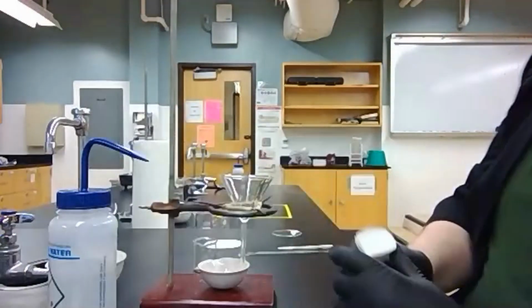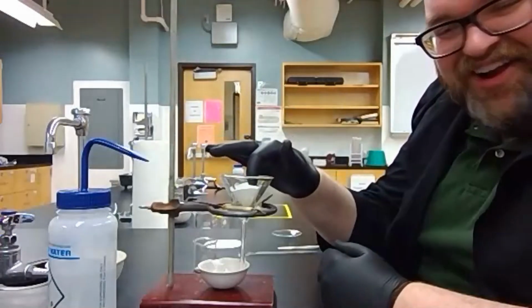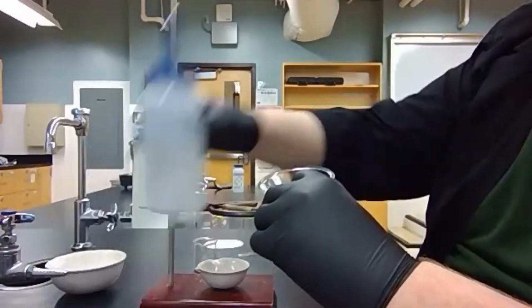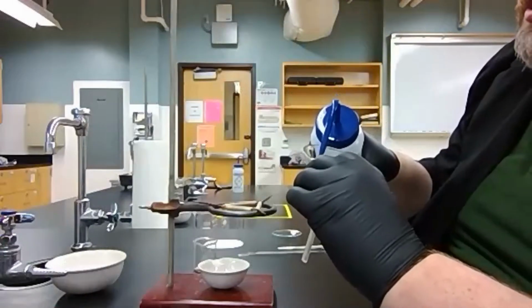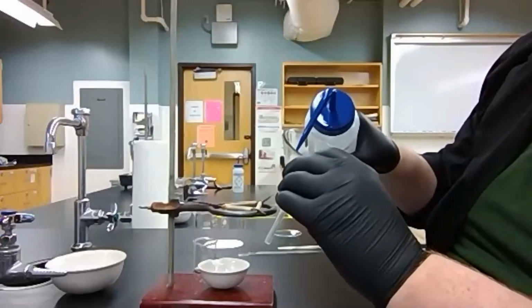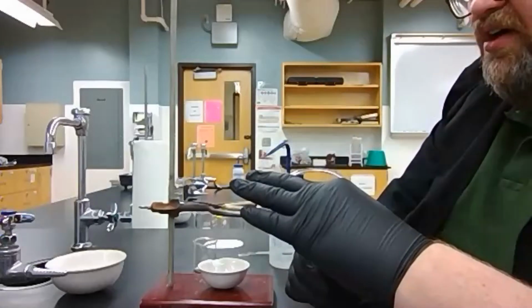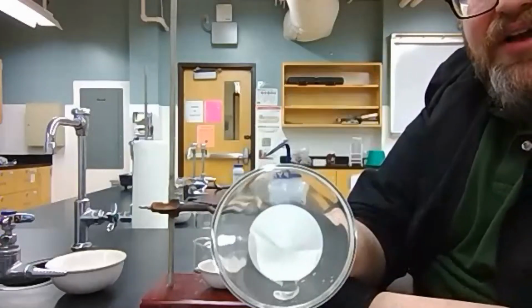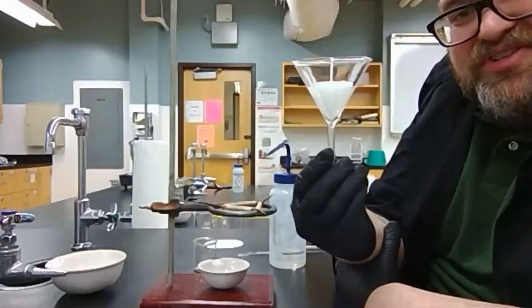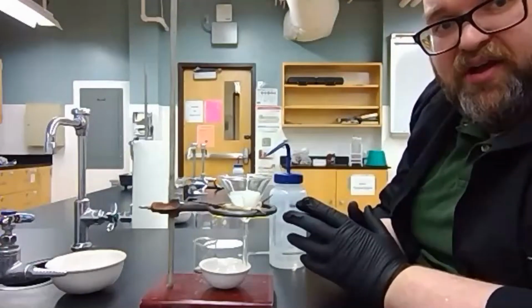Okay, now this is ready to fit into my funnel, but it's not sitting very well in there. So what I'm going to do is I'm going to take my funnel out and I'm going to use just a little bit of deionized water, and I'm going to do what's called wetting the filter paper. Wet paper sticks to glass really, really well, okay? So by just making the filter paper itself a little damp, it's now adhered to the funnel, and I've got a little bit more stability out of this. So now I'm ready. I can start my process.